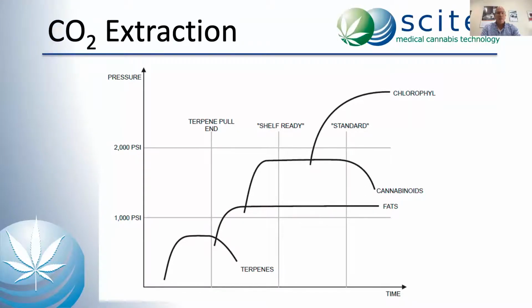This comes at a significant cost, however, that is not often spoken about. Your extraction yield, as in how much of my cannabinoids do I actually get, will be suboptimal. That will be costing you real money. One solution could be to fractionize and continue runs. You would then have to post-process the dirty fraction to optimize yield, thus income.